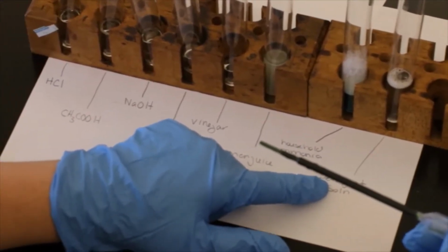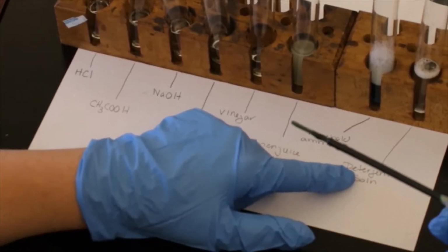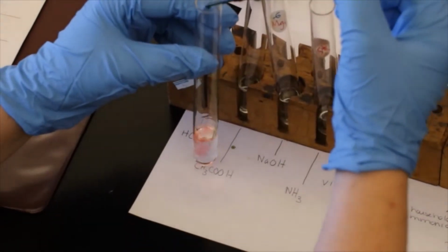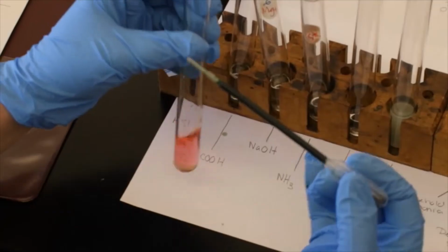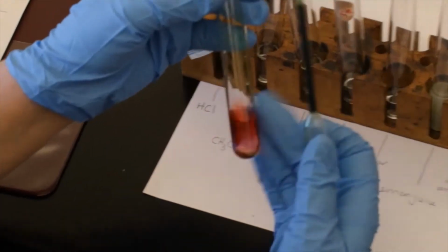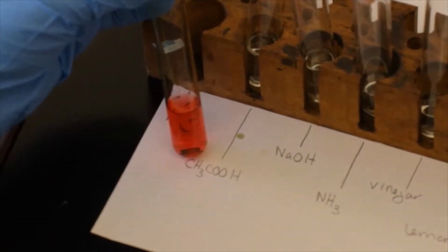So as we're going through, we're going to add our universal indicator, and then I want you to compare that to what you see on that sheet that's posted. So let's go with our HCl first. We're going to add a couple drops in, and as you can see, that green turned into a dark, kind of this bright colored red. Okay, there it is. Nice deep dark red.